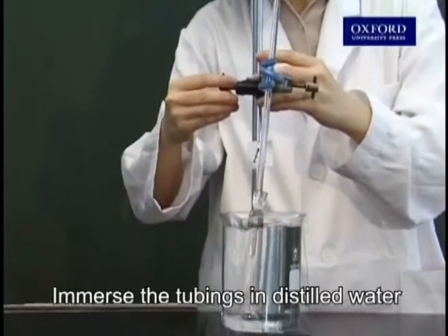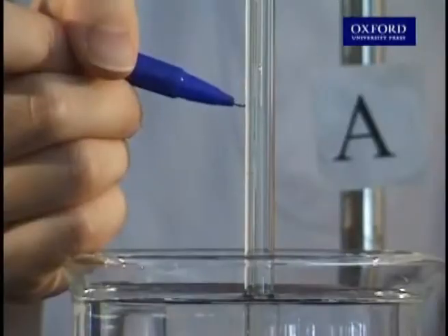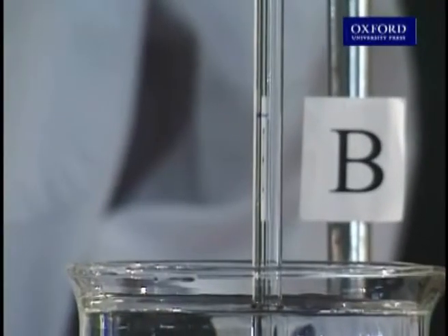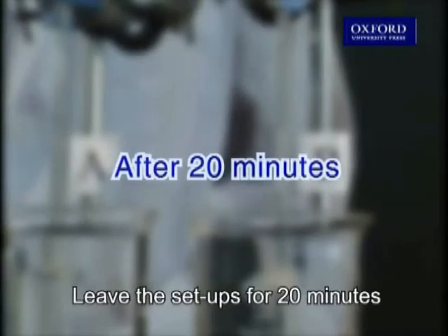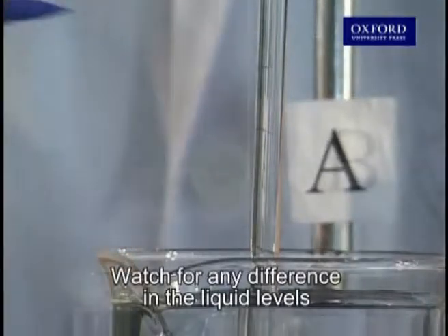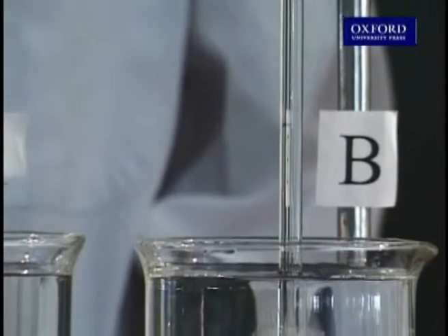Immerse the tubings in distilled water. Mark the initial liquid levels. Leave the setups for 20 minutes. Watch for any difference in the liquid levels.